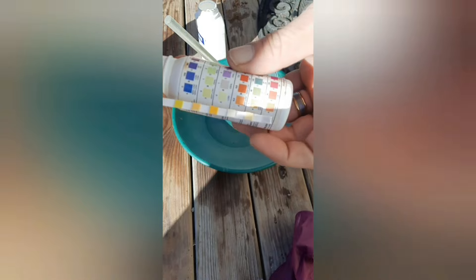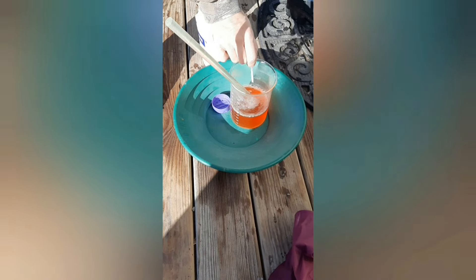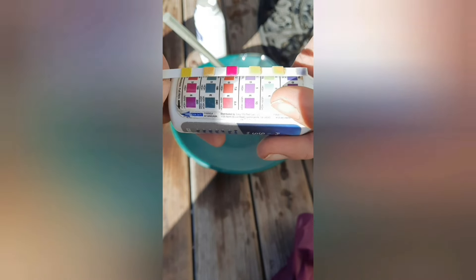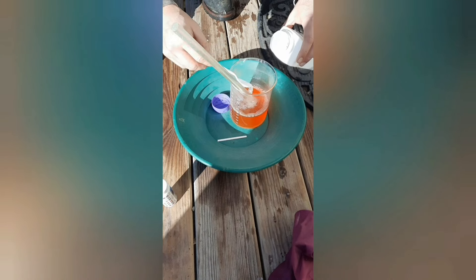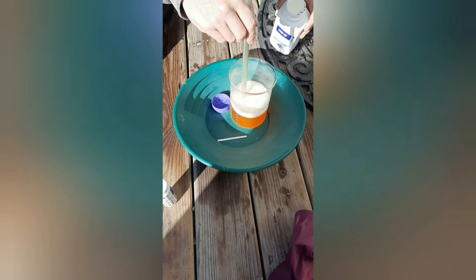Let's get a test strip. We're at like 8.4 right now — we need to come down a lot. So let's keep going — add it little by little and check it. If you go too much it can be disastrous, trust me. I'm not going to use zinc powder like I've been doing in the past because it just takes way too long. I'm going to show you guys this new trick I've got and it works really, really well.